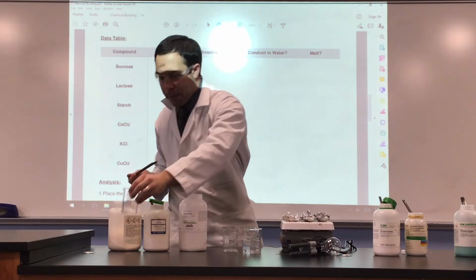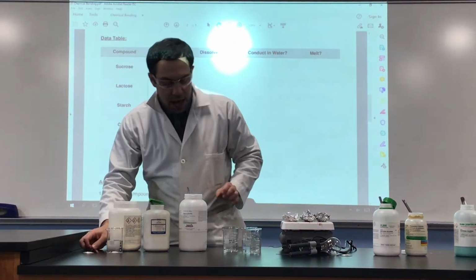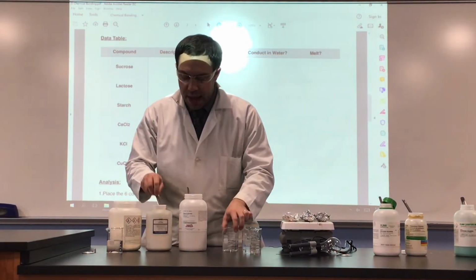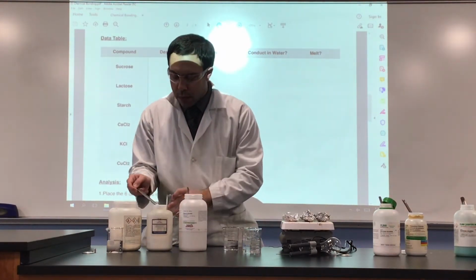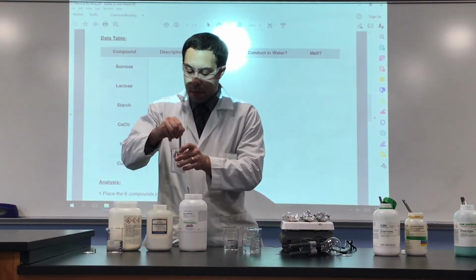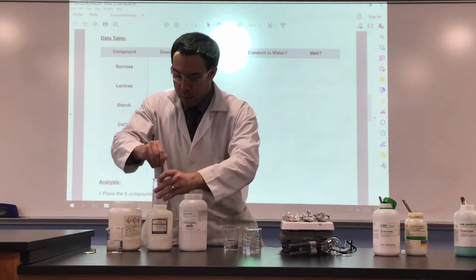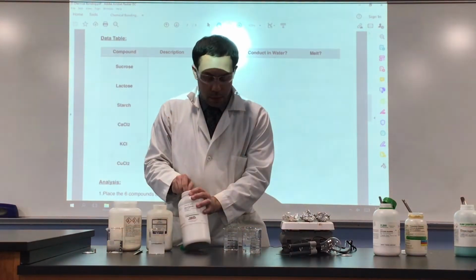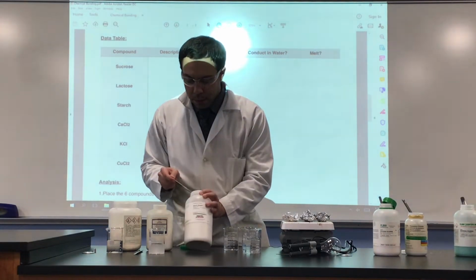Try to stir. Leave that on the side. We'll come back to it in a little bit. Next, we'll try the lactose. Stir. Let it settle. We'll come back to it in a little bit.